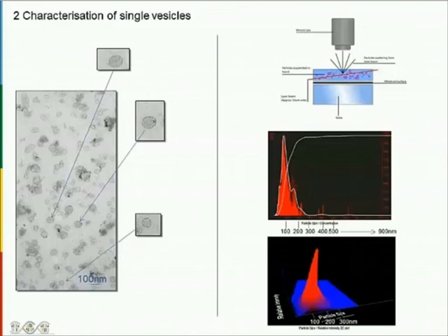And also, in addition to microscopy, for example, one of these other newer techniques, NanoSight or the iZon or something similar, to look at the vesicle population as a whole. Ideally, you want a description of the vesicle size distribution and an idea within your population of how much of the material is actually not likely to be small vesicles. There are some examples here of particles which are 400, 500 nanometers or more in size, but these are relatively rare events in this example. The predominant material is small, around 100 nanometers or so. So that would be fairly typical and fairly reasonable as an exosome preparation.